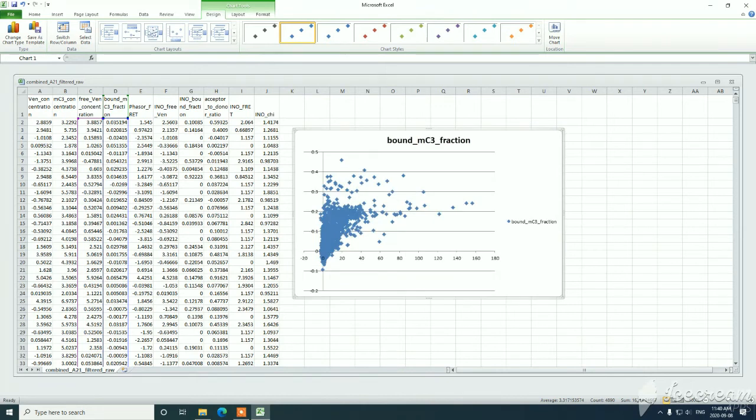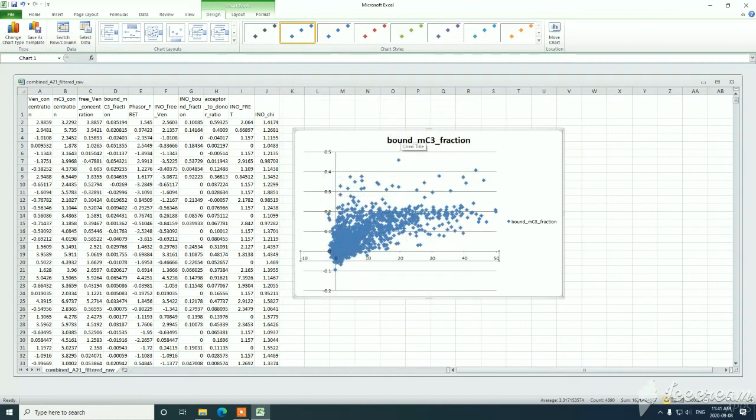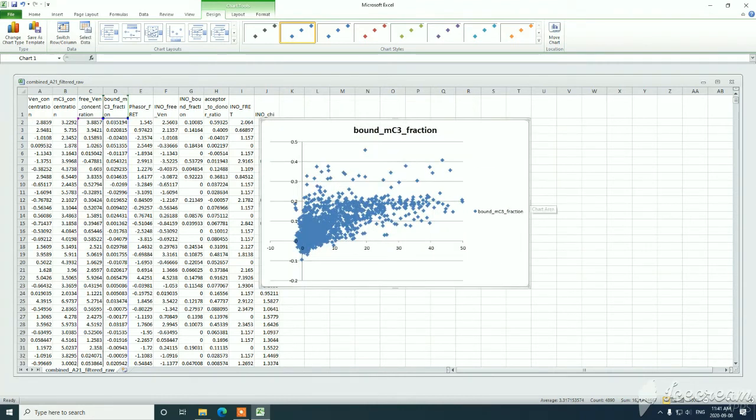You can see at this stage we've plotted the entire range of concentration of free Venus in every ROI. In subsequent steps, we will be filtering all the data such that it's less than 50, so this data will be removed because we have no confidence in our estimation beyond the point that we sampled in our original protein gradient. So I'm going to just cut out that data.